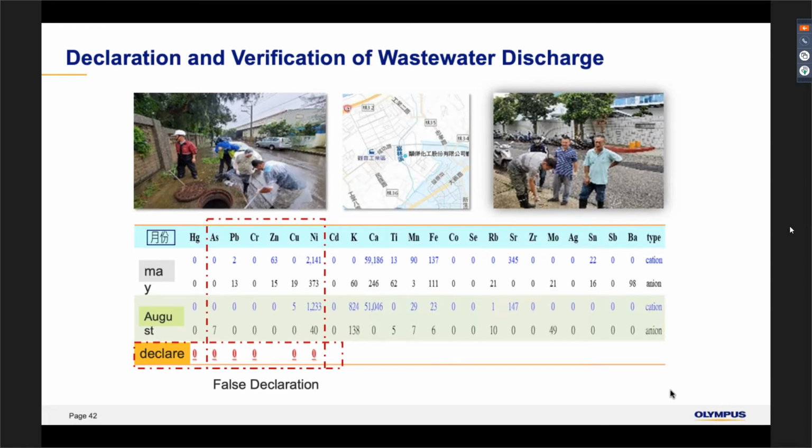Yeah, so as we mentioned just now, we actually did some calibration comparing with the AAS or the ICP. So the calibration used in the XRF is actually based on what Prof. Chang has done in his laboratory.